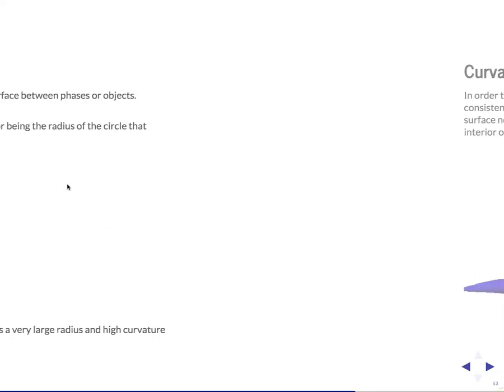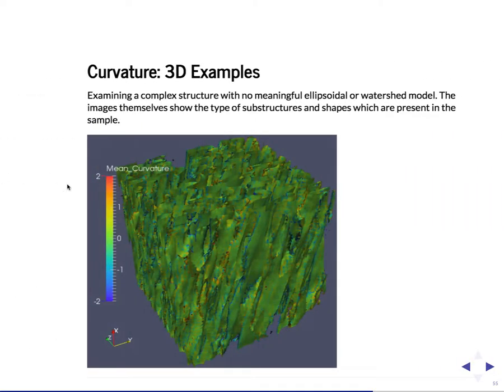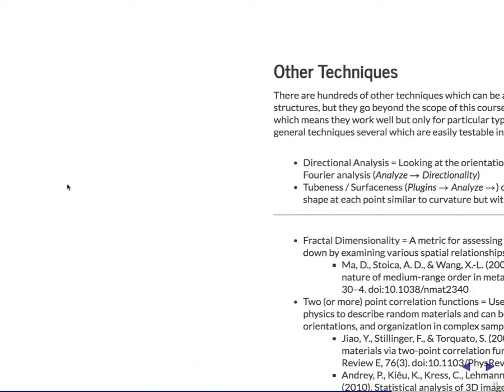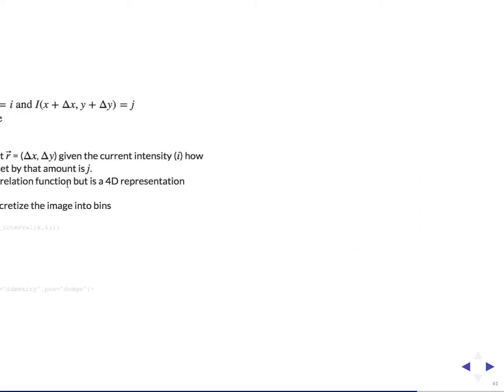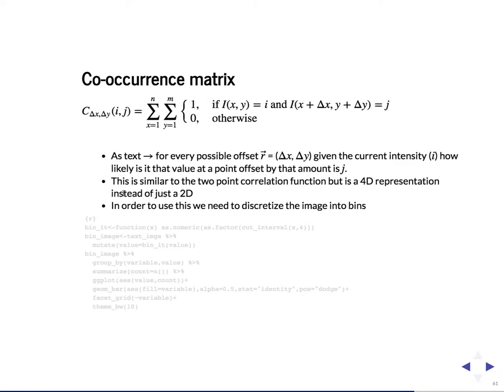So we covered most of those things already, some surfaces. The last aspect that we added was on the texture analysis. This was where we had this idea of a co-occurrence matrix, where we go through the image and we look at points, or intensities, that occur close to each other frequently. The intensity values are i and j, and the distance away is delta x and delta y.